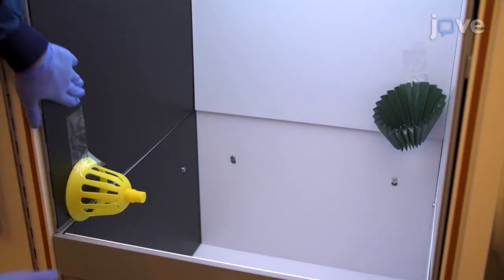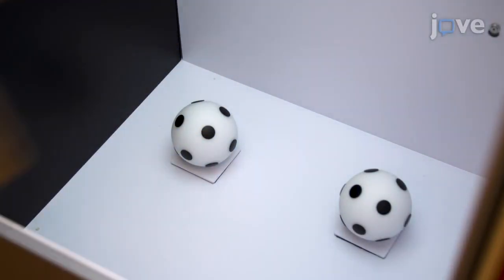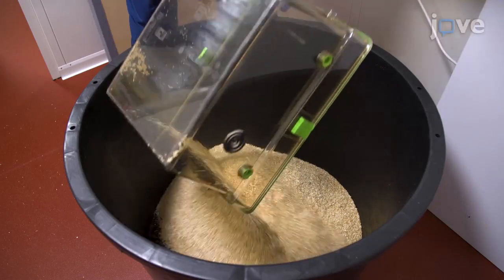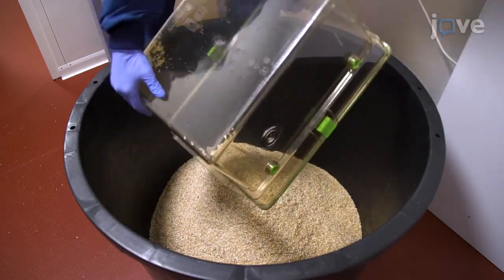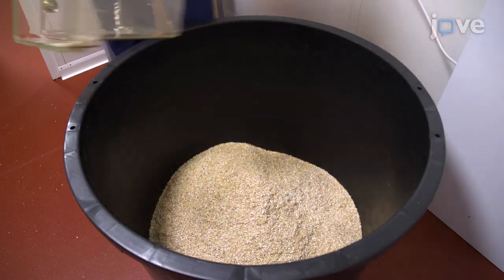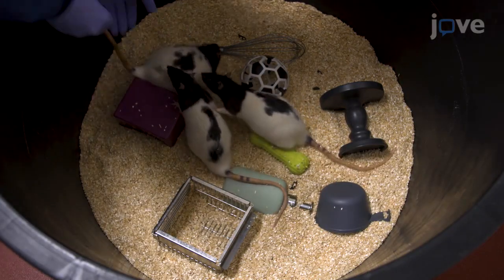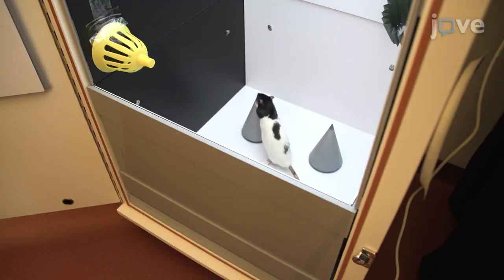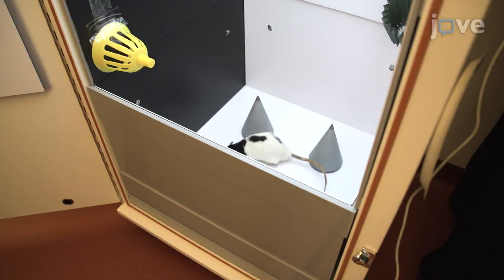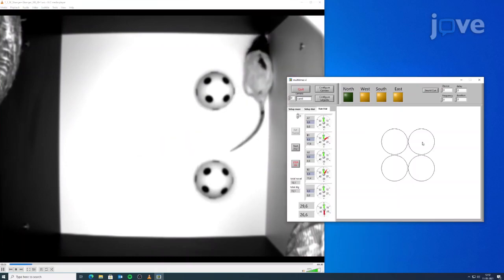The object location task allows us to investigate various mechanisms of the formation or retention of spatial memory, by taking advantage of the spontaneous explorative behavior in rodents. This protocol allows for the repetition of an object location task up to four times, helping to increase statistical power and the efficiency and output of studies that involve surgical procedures.